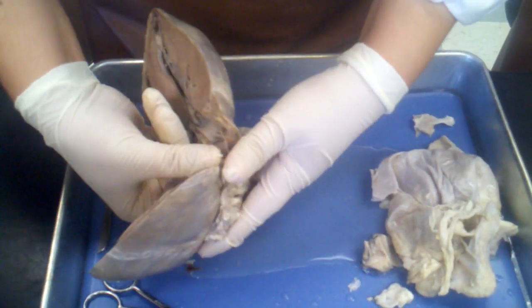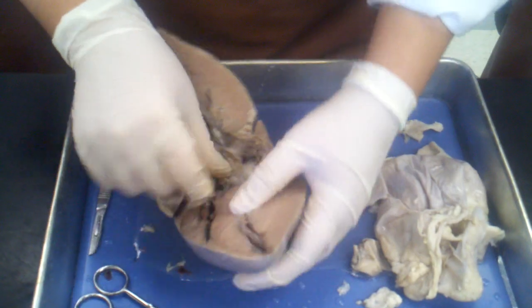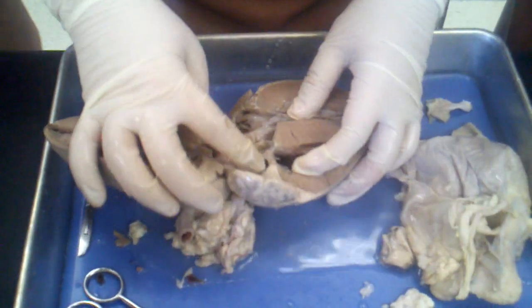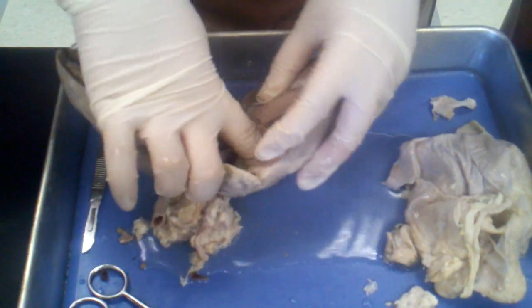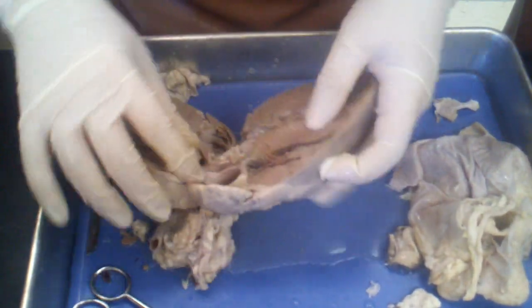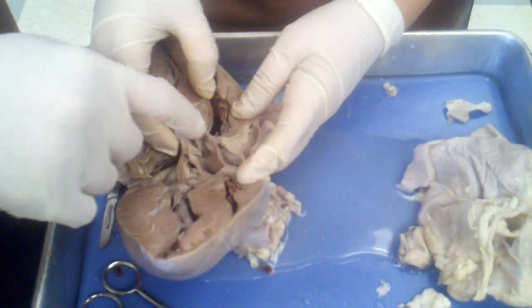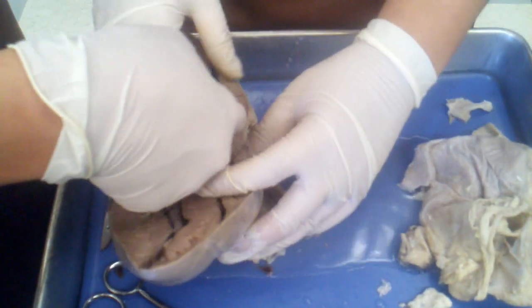Can you see the tricuspid valve? Here's the tricuspid here — one, two, and then the third one's in there a little bit more. So the tricuspid's in there, leading down there.